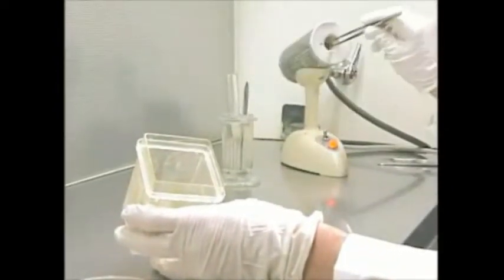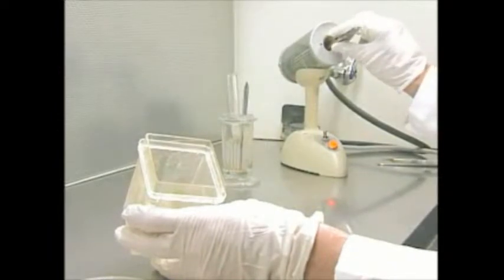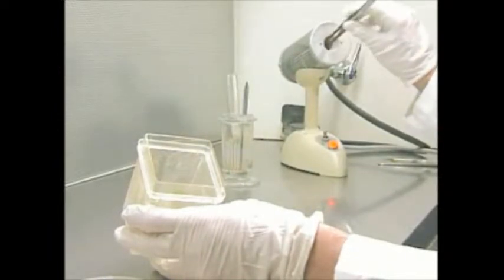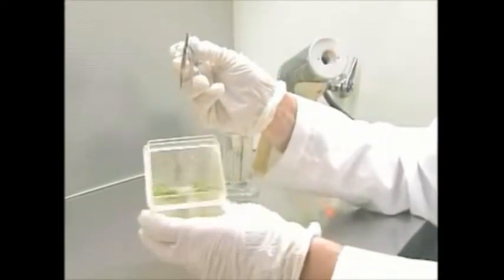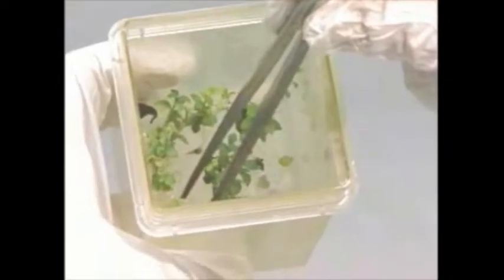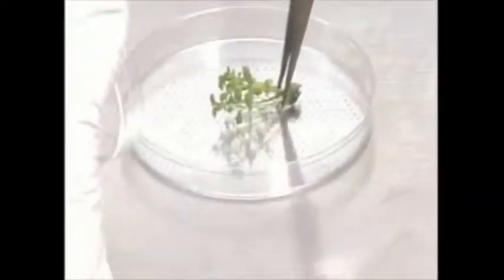I have to surface sterilize them in this red hot bead incinerator for about 10 seconds. Allow them to cool for just a moment. And then reach into the culture vessel. Use them to pick out one of those clumps very gently. Can't touch it with our fingers to avoid contamination.